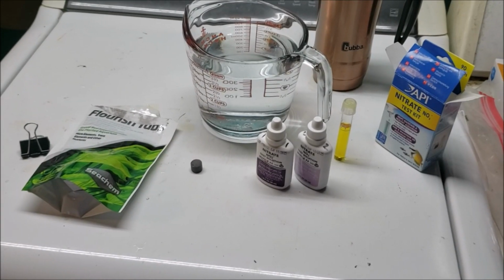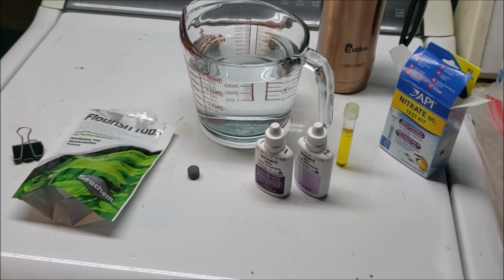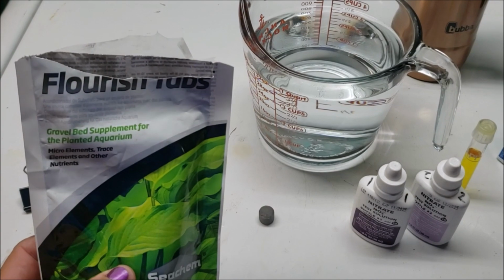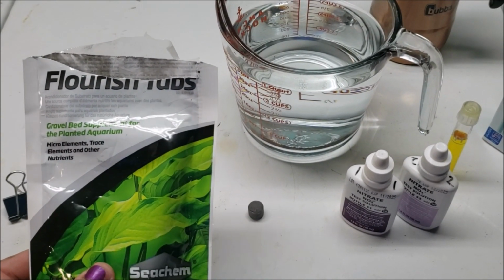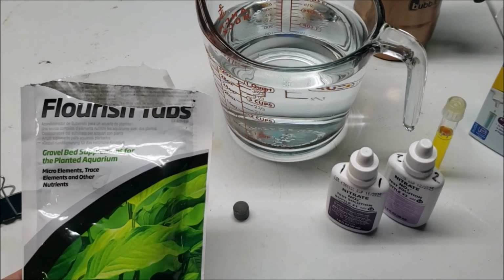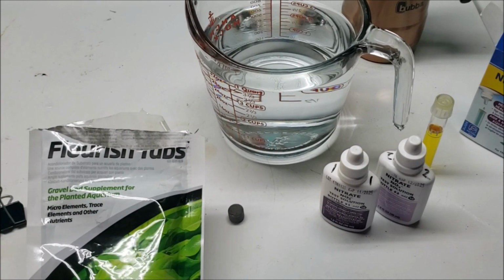Hey everybody, I am going to do a very simple experiment today, and it is going to involve my root tabs here. I noticed that there is a little bit of nitrogen in these root tabs, and I'm wondering whether or not they will impact the nitrate level in our aquarium. I don't believe they will. I really don't think it's going to make any difference whatsoever, but I'm curious, and so I'm going to find out.